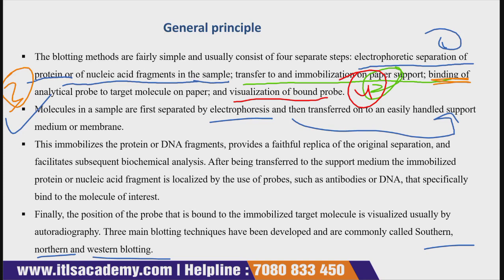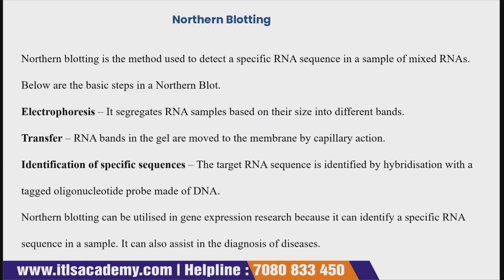Now let us understand what Northern blotting is. Northern blotting is a method used to detect a specific RNA sequence in a sample of mixed RNAs.